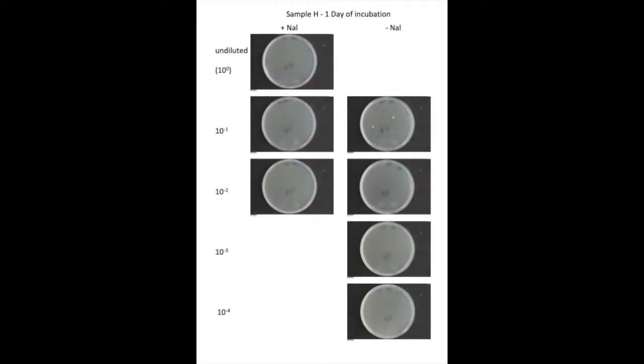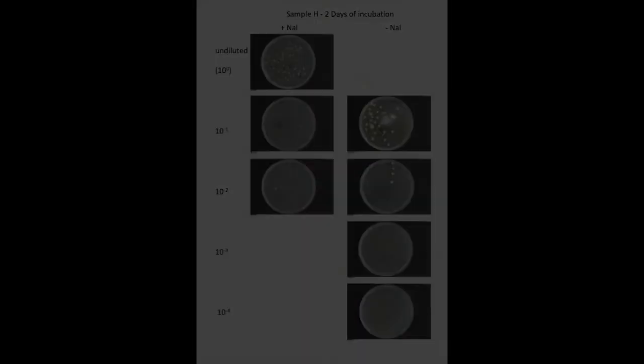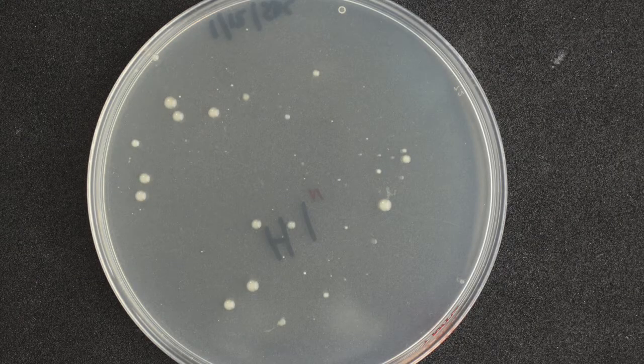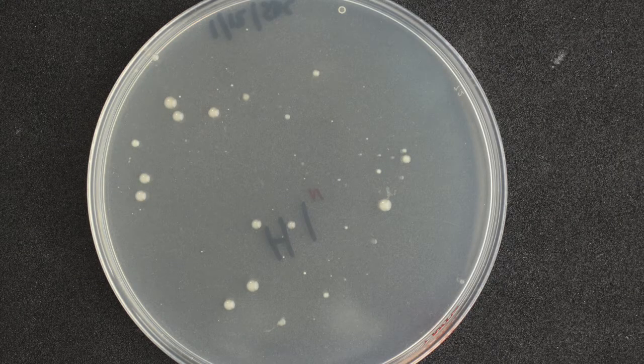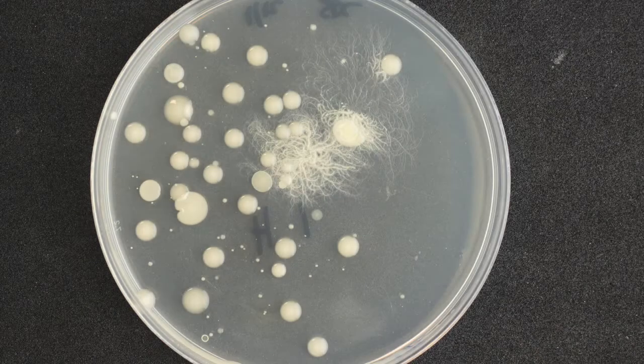The results with sample H are very similar, with very little growth after one day of incubation, but significant growth at the higher concentrations after two days of incubation. Here are close-up views of the 10 to the minus 1 dilution on nalidixic acid and without nalidixic acid.